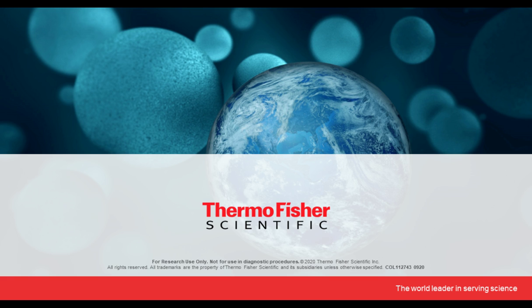But there is enough flexibility that you can use any software you might be currently using for quantitative Western blotting. For example, ImageJ, which is free software, also works really well for that purpose, as well as any other software that enables that kind of quantification.